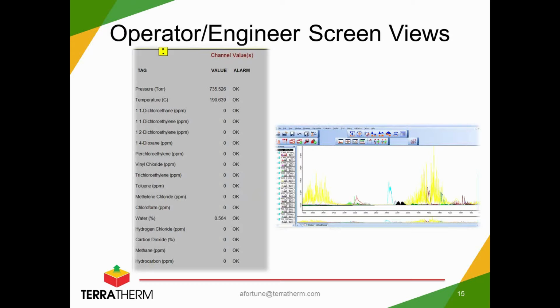So I would routinely dial in and just spot check these spectra and make sure that we weren't seeing any kind of really strange interference or something that was not as expected. So there was definitely a learning curve for this particular site, as there would be for any new site, to know what's normal, what's the normal vapor look like here, and that way you're able to identify when something is out of the ordinary. But for the operators, very easy screen view there.